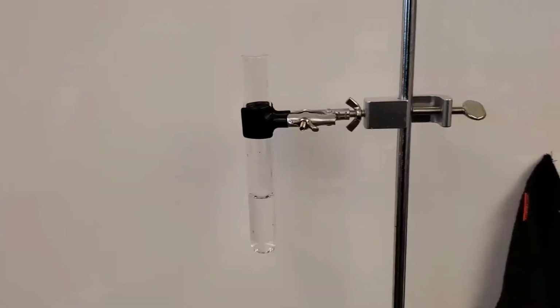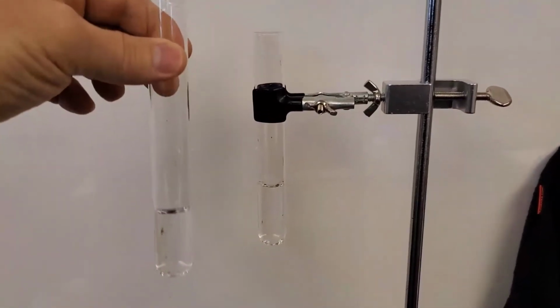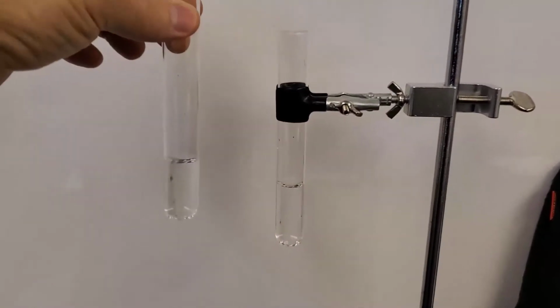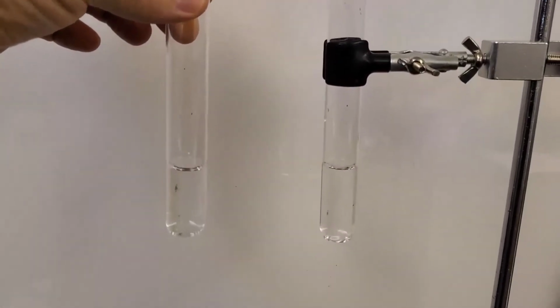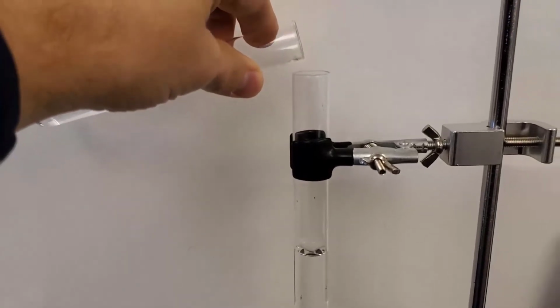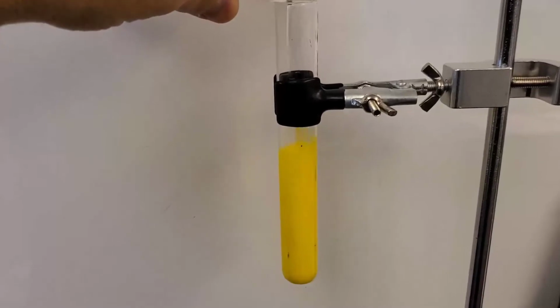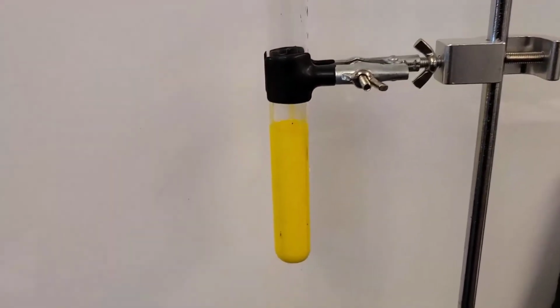So let's take a look. All right, so here's one compound, and here is another one. And what I'm going to do is I'm going to pour them together. You'll know they're clear liquids, and watch what happens when I pour them together. So isn't that cool? Look at that color. It's so yellow. That is lead iodide, or lead(II) iodide officially.